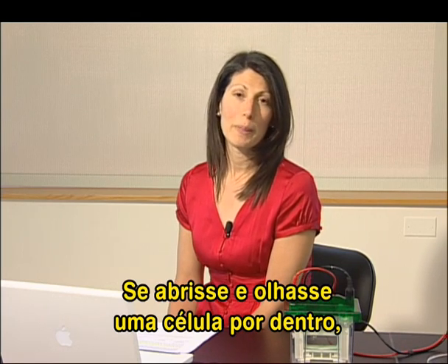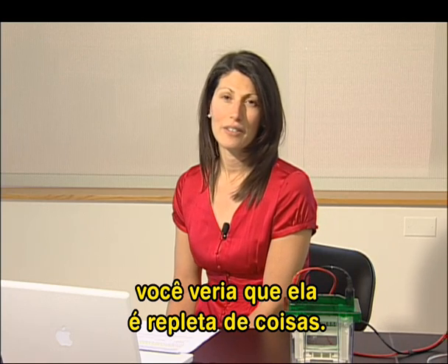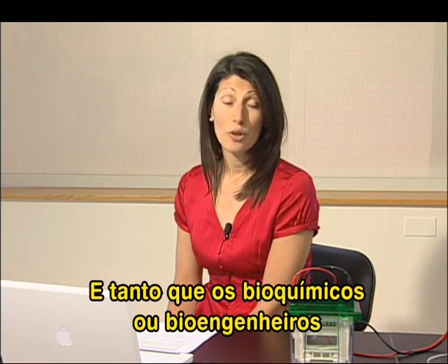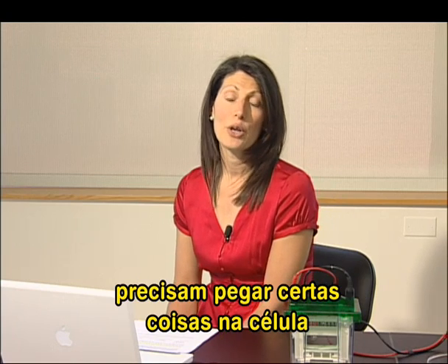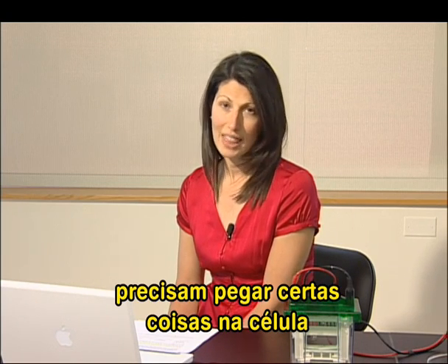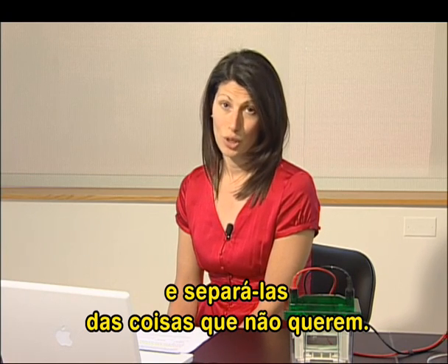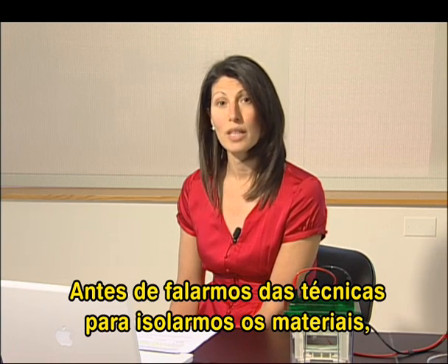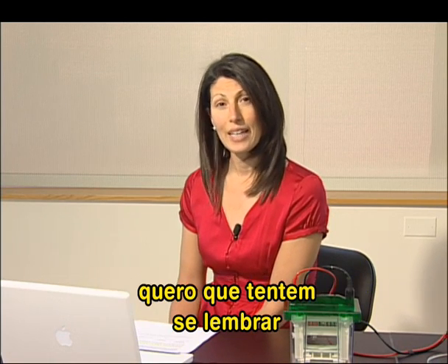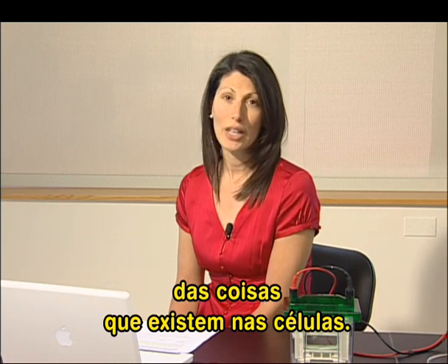So if you were to open up a cell and look inside, you'd see that it's really crammed full of materials. So full, in fact, that as biochemists or biological engineers, you might need to take apart some of the things that are in the cells and separate the things you want from the things that you don't. So before we start to talk about the techniques for doing that tweezing apart of materials, what I'd like you to do is take time in your classroom there and remember the kinds of things that are in the cells.